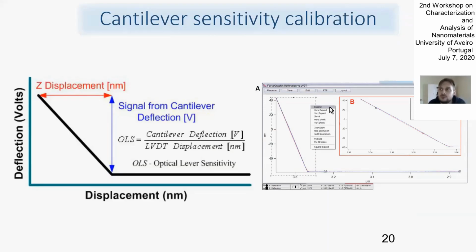For example, to use some silicon or some really stiff metal or glass, and in that case you will not have any deformation of the surface under the action of the tip, and you have only deformation of the tip itself.